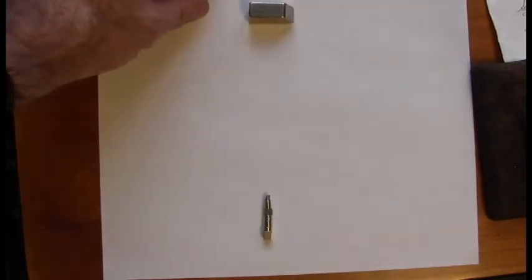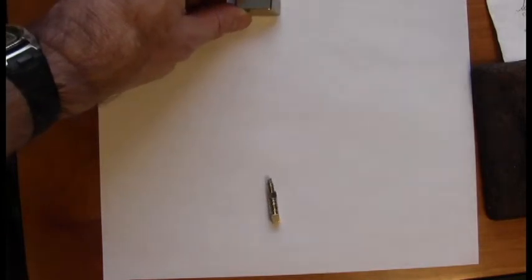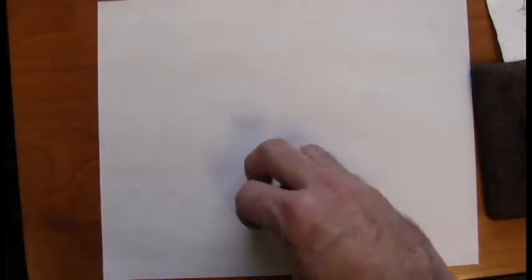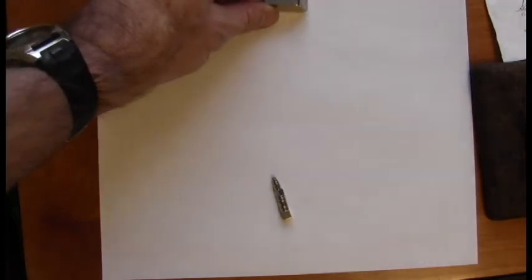Here's a small neodymium magnet representing a magnetic nucleus, and I'm bringing in a large neodymium magnet representing the NMR's external magnetic field. And notice, no matter how the small magnet is oriented, when the external magnet shows up, it always aligns itself North Pole to South Pole, whether it starts off to the right, starts off to the left and pointing down, as in this case, or starts off pointing down and to the right. When the external field shows up, the little magnet always aligns itself with the big magnet.